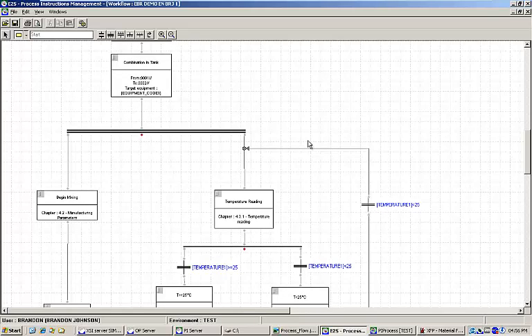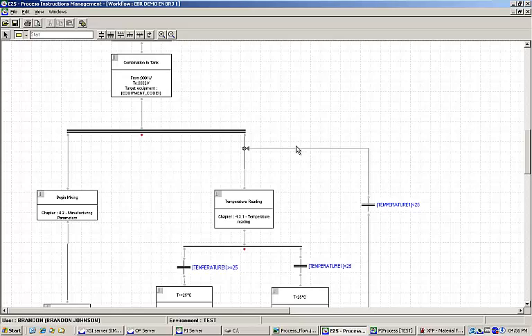Once an EBR has been designed and approved for production, it can be merged with a work order and launched. Work orders can be generated locally within XFP or can be sent down via an interface with an ERP system.